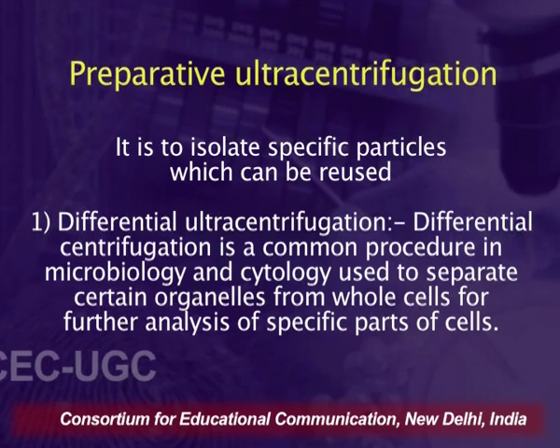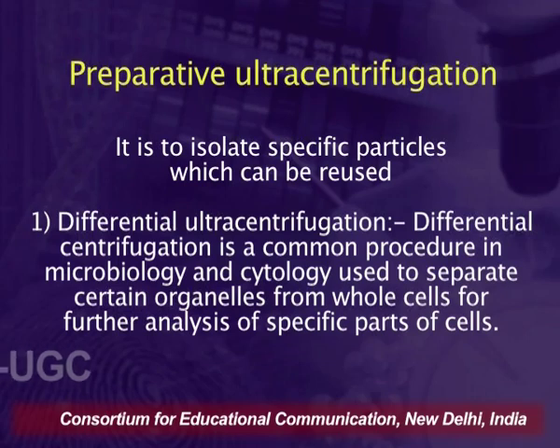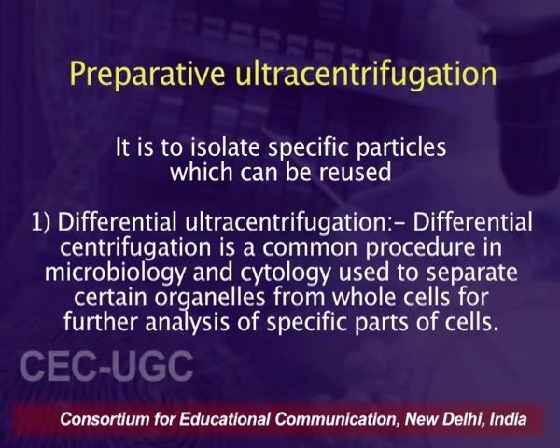Preparative ultracentrifugation is used to isolate specific particles which can be reused. It can be of different types, like differential ultracentrifugation, which is a common procedure in microbiology and cytology, used to separate certain organelles from whole cells for further analysis of specific parts of the cells.